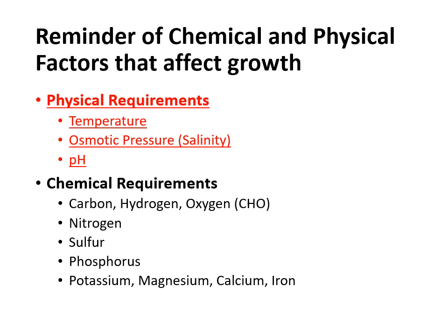Now today, instead, we're going to focus on the physical requirements, and we're going to look into some lab experiments that can help us analyze this or to characterize each bacteria. Whenever you hear the physical requirements of growth for microbes, there are three that I want you to think of. There's temperature, osmotic pressure, which means how much salt is in that media, and there's pH. Okay, so remember temperature, osmotic pressure, and pH.